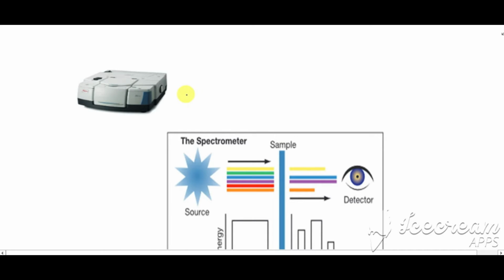When the IR radiation passes through this mirror, the light will be spread to our sample.